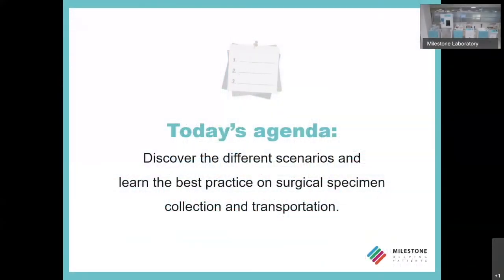So let's see together what will be the agenda of today's webinar. We will discover different scenarios and try to learn the best practice on surgical specimen collection and transportation. That will be the aim of today's webinar. Then, as mentioned by Michela, we will have a practical live demonstration from our laboratory at Milestone headquarters.